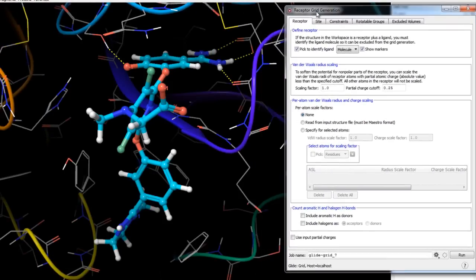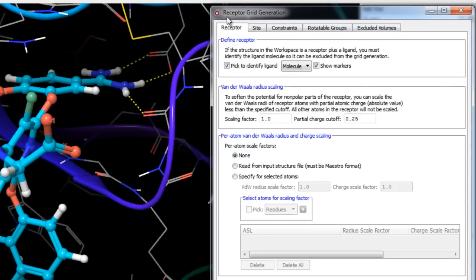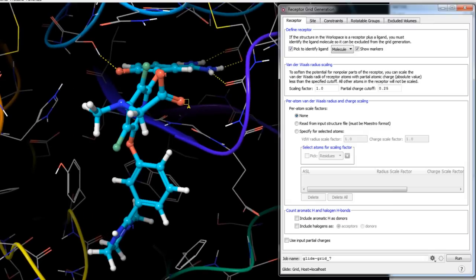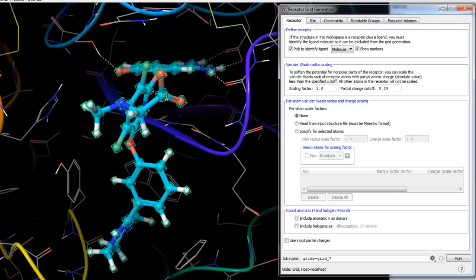The first tab in the receptor grid generation panel covers defining the receptor. The Define Receptor section contains options for defining part of the system in the workspace to be treated as the receptor. Since we have a receptor-ligand complex, we'll need to pick the ligand. The selected ligand will be excluded from the receptor grid generation calculation and will not be present during the ligand docking stage.